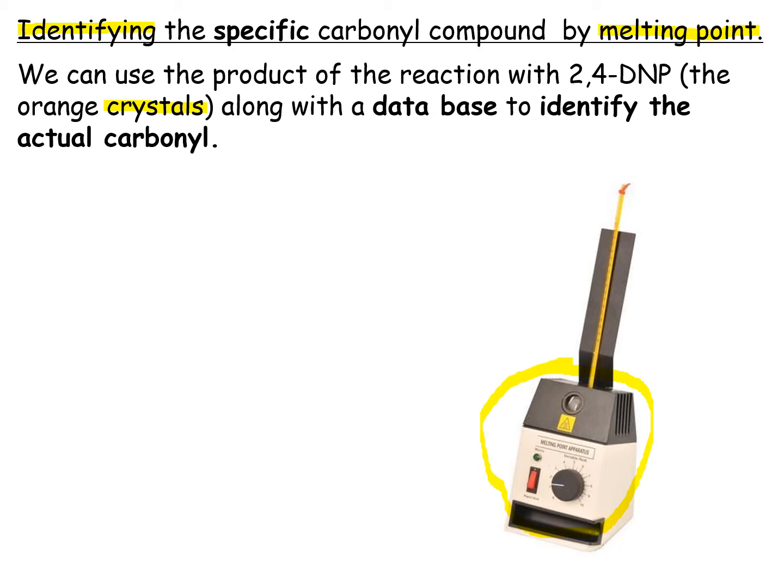And you're going to record the temperature at which the crystals start to melt and finish melting. Now, how are you going to know? Well, you've got a little viewing window here that's actually a magnifying glass, and if you look into that, you'll see the crystals in your capillary tube, and you'll watch them.